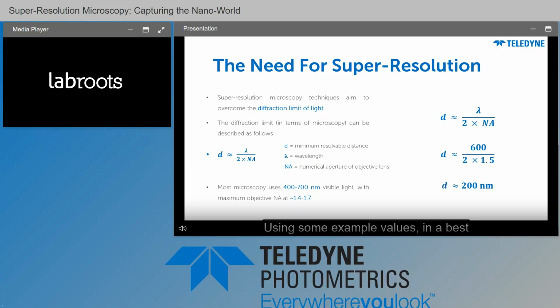Using some example values in a best case scenario, where 600 nanometers is also where silicon-based scientific cameras are the most sensitive, we can calculate a diffraction limit of around 200 nanometers. This means that resolving details smaller than around 200 nanometers is affected by the diffraction limit, and high-resolution imaging beneath this scale is challenging to achieve.